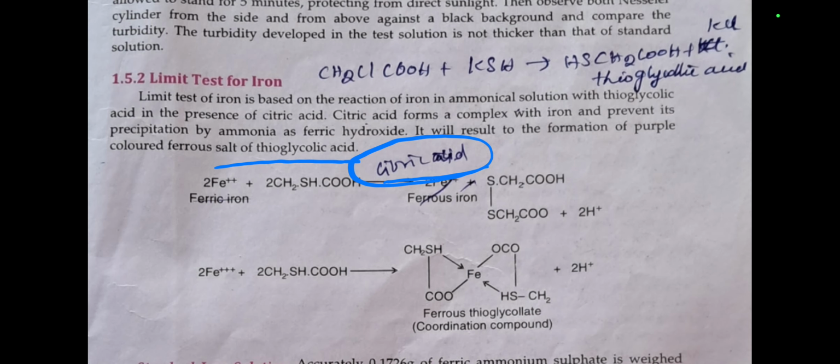That will give a colored solution, and by comparing the color of the test with the standard solution, we can identify whether iron is present in the given substance as an impurity or not.